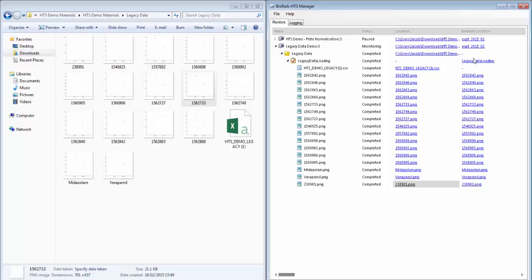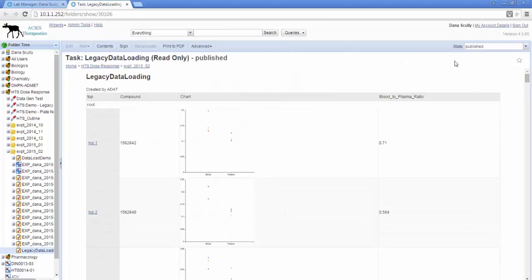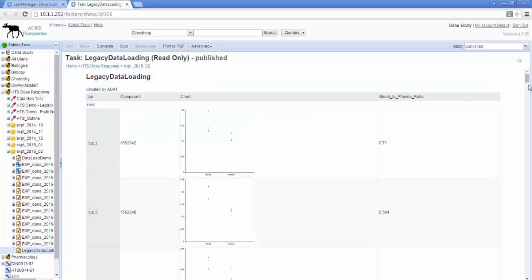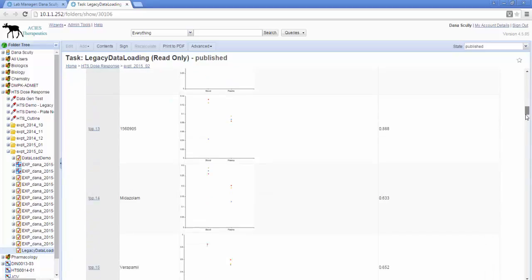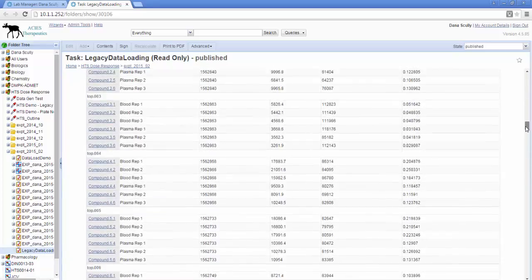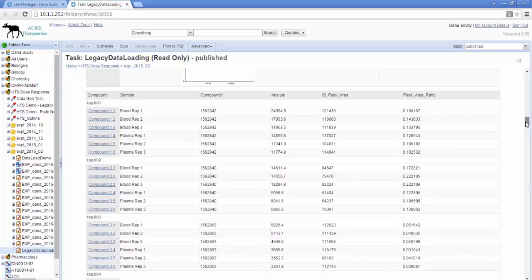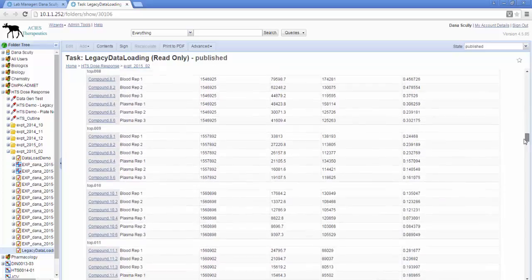We can go and have a look at the BioRails location for the task and can see that the compound has been uploaded with its associated chart and blood to plasma ratio. That's true for every compound. We can see that the actual results have also been uploaded correctly.